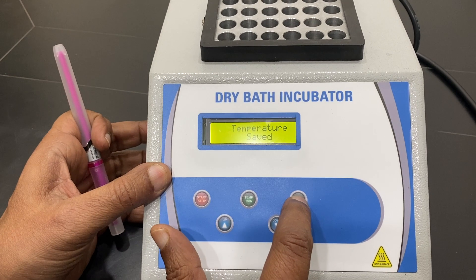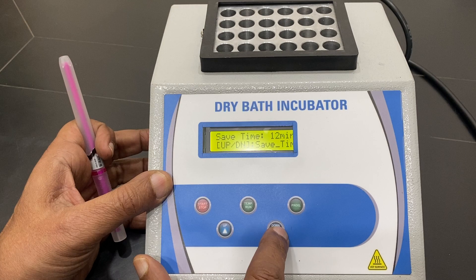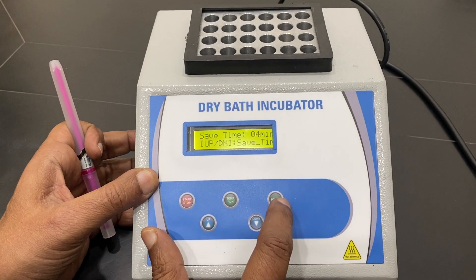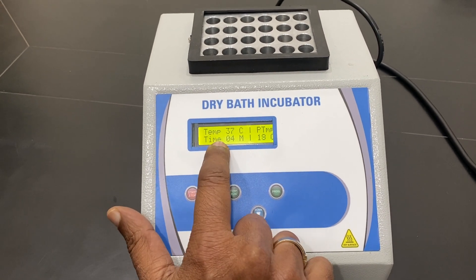You put it down, saved temperature, and now the saved time is there — 10 minutes. You can increase or decrease it, say by one minute to four minutes. Enter it and then it saves the time. Working is very easy.